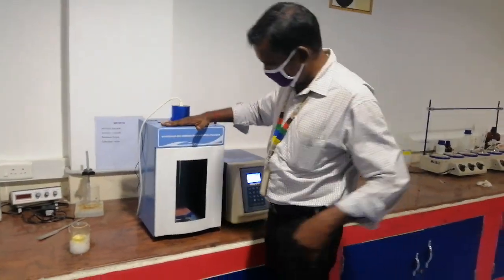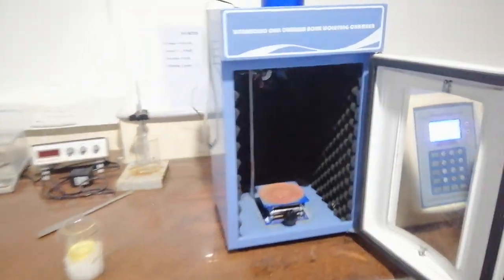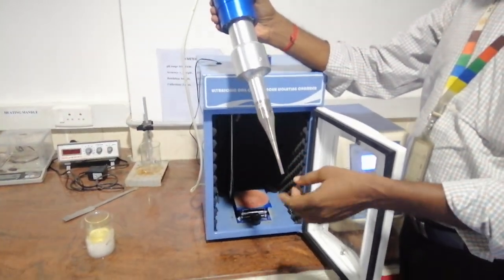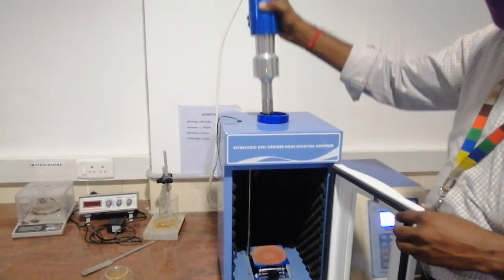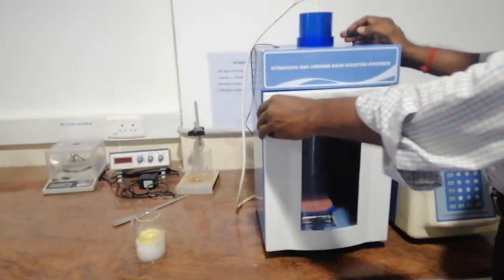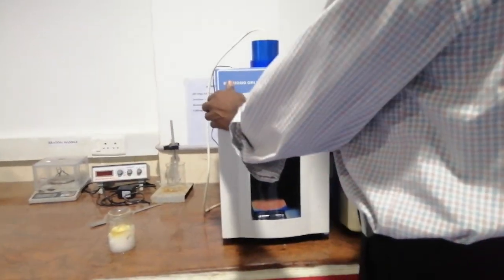So this is the chamber where the ultrasonic wave will be generated. This is the ultrasonic probe connected with the regulator. For different samples, we have different sizes of ultrasonic probes. This is kept in a small chamber to avoid noise pollution. If it is closed, the noise will not come out, so we can avoid noise pollution.